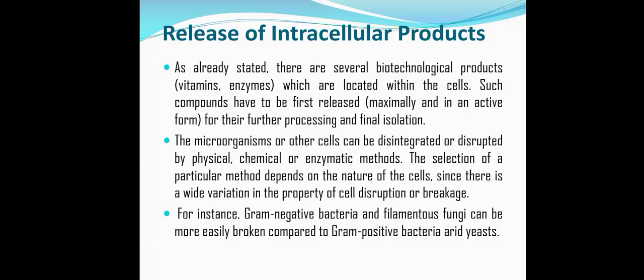Hello everybody. Now we are discussing downstream processing. Downstream processing refers to the steps involved in the extraction and purification of the fermentation product from the fermentation broth.